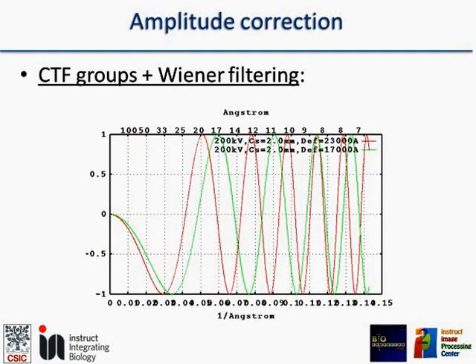Okay, so you have micrographs. These micrographs, as we saw yesterday, have been affected by a contrast transfer function that modulates the Fourier coefficients in different ways. So for instance here we are forgetting for the moment about the envelope, and we see that all these frequencies in one of the micrographs, the red one, have been multiplied by a number, and in the green one has been multiplied by a different number. So the phase correction is simply inverting the sign of these coefficients, but it is not compensating for the number that they have been multiplied by.